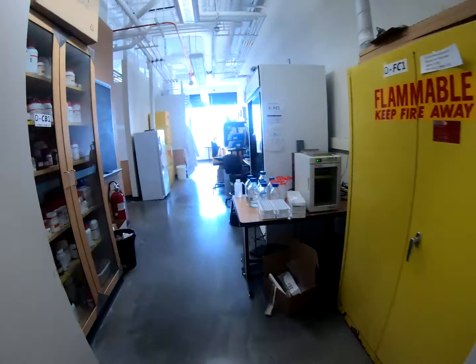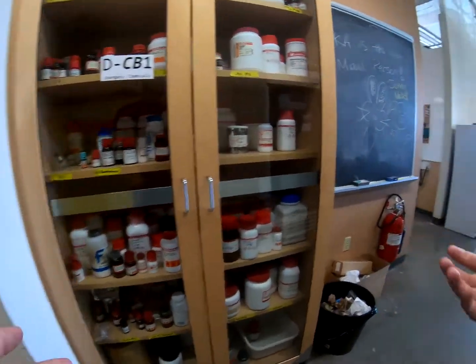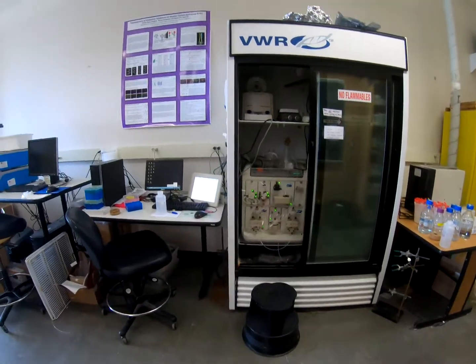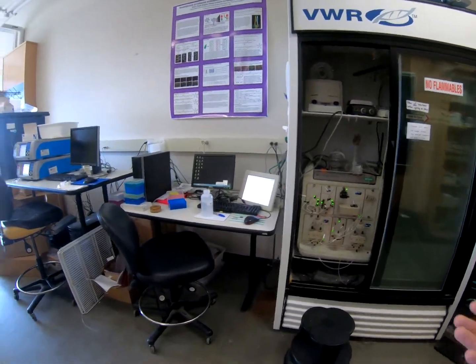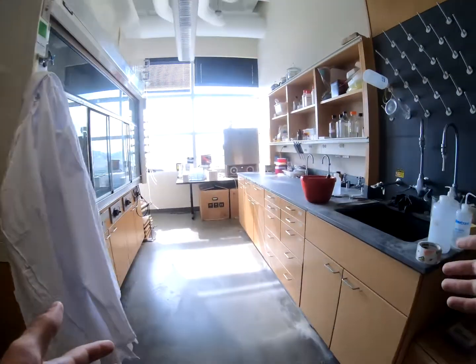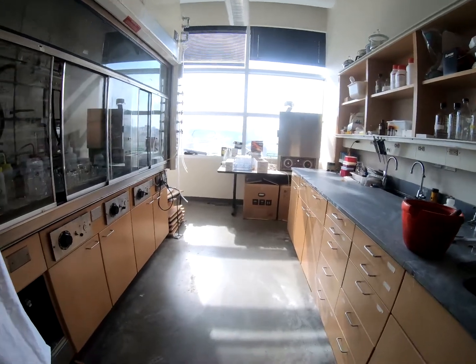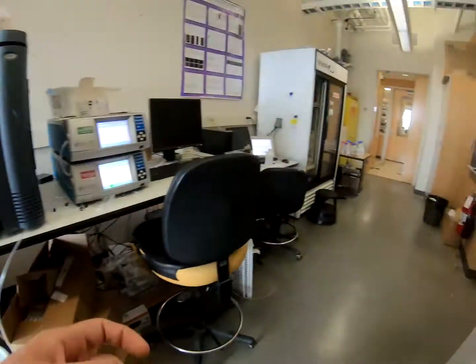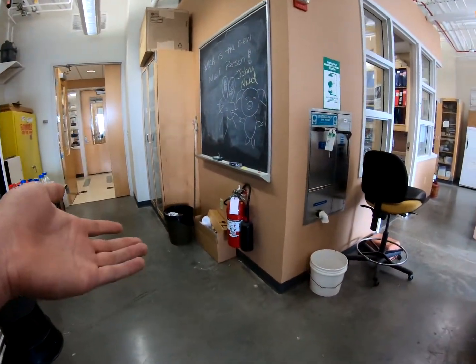When you walk into Lab D, the first thing you'll see is more chemical storage for our inorganic chemicals. On our right over here, we have our FPLC, which we use to purify proteins that we've been expressing, typically by our cell cultures. At the corner here, we have an empty desk that can potentially be occupied by one of our new rotators that could be joining this year. And another one of our eye wash stations and our fire extinguisher.